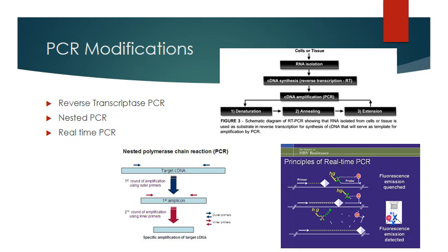In the process of real-time PCR, which is a big thing, doctors love that term. I want real-time PCR, okay? That's because this technique is based on the regular PCR reaction. It uses that, but it uses computers and the current technology that we have to monitor the amplification of the targeted DNA during the process, so after each cycle. And in real time, that's what they mean by real-time, not only as an end product, okay?